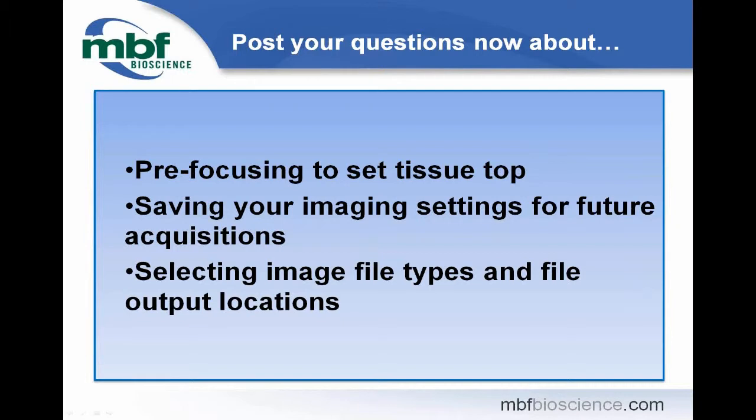Our engineers have been working towards improving our ability to handle specific image data files. We found that using JPEG 2000 results in very high quality images that are an order of magnitude smaller in size than conventional JPEG images. Also, our software works with JPEG images in such a way that you will always retain your original data. Making modifications to things like brightness, contrast, or saturation levels will not actually change or modify the original data. In this way, it is always possible to go back to your original data that you have captured and look at it once again fresh.